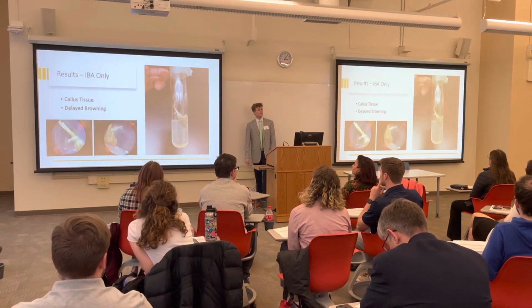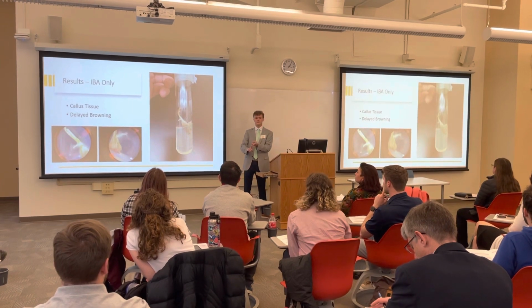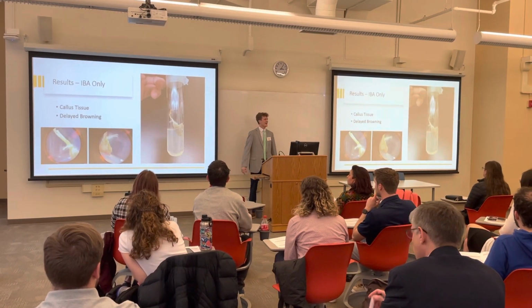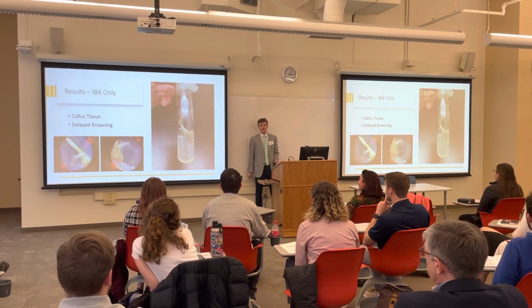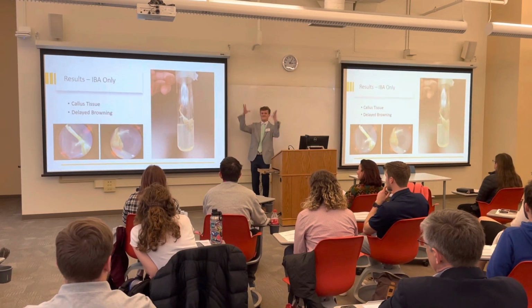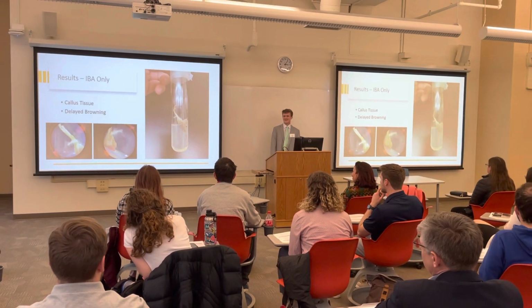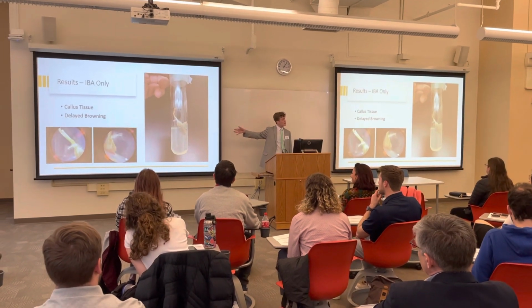First result section is our IBA section. These are using either 1 ppm or 2.6 parts per million of IBA only. We got tons of callus tissue. This was so exciting for us. I remember the day my professor walks up to me and he says, "Ty, you should check on your plants. There's some fun activity going on." So I run down there and I look. I got callus tissue. I got plant tumors. I'm like ridiculously excited about this. I know, it's really fun. And so the other thing is the browning was super delayed.